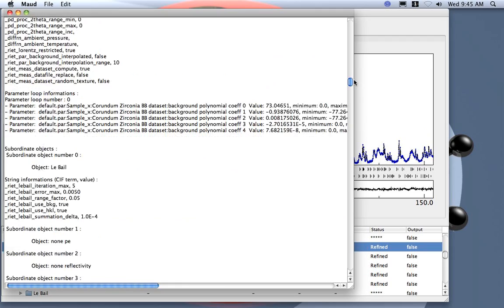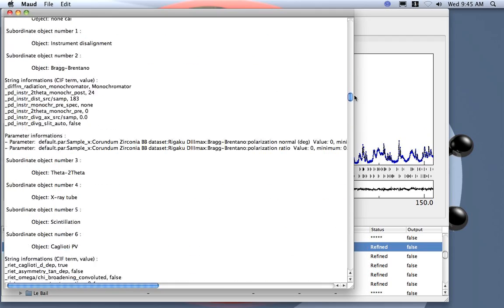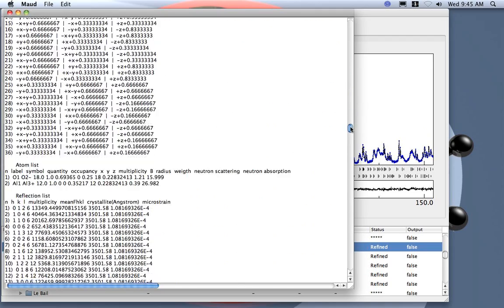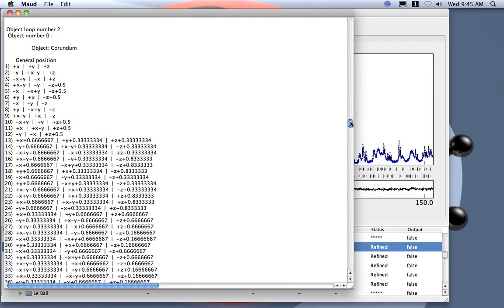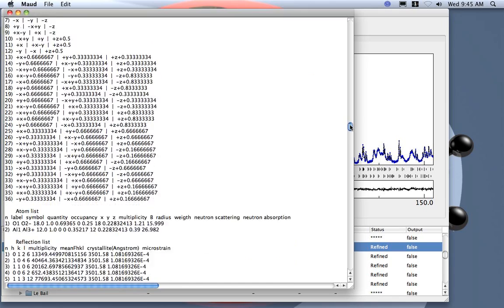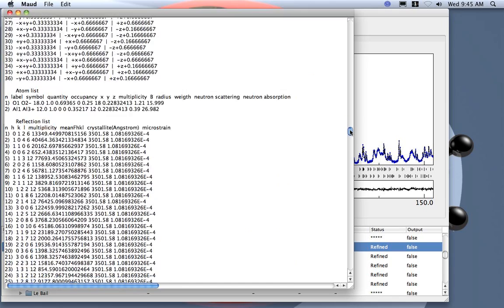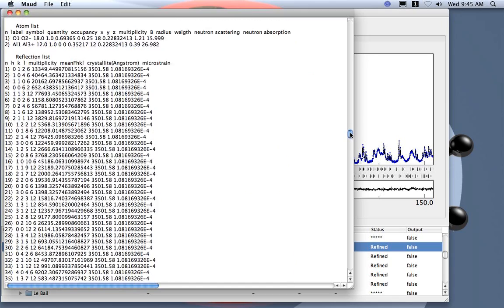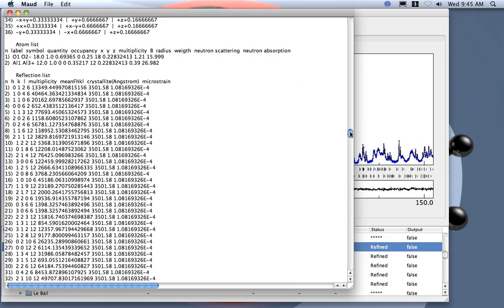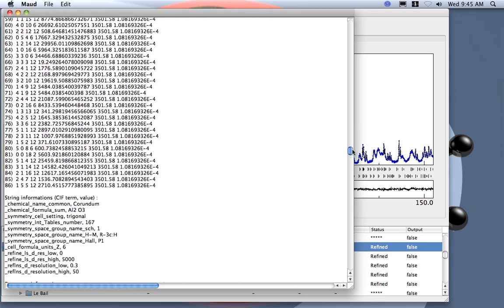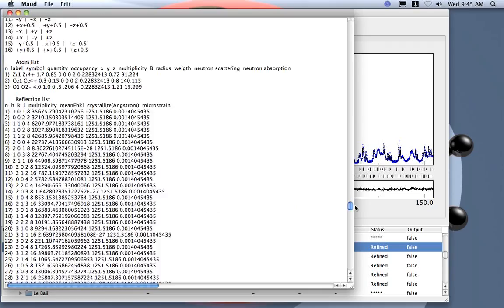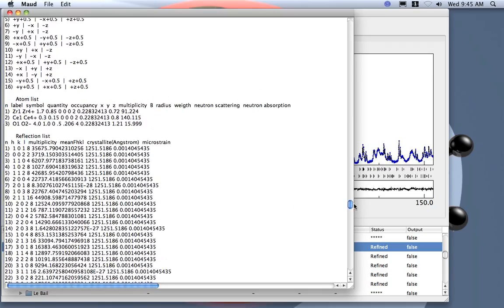Then the list for every object inside the program, just to check if everything was okay. List of atomic positions, reflection list. This is for corundum, and there should be one for the zirconia.